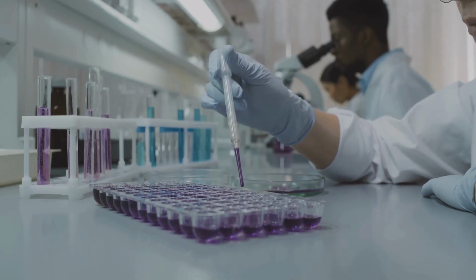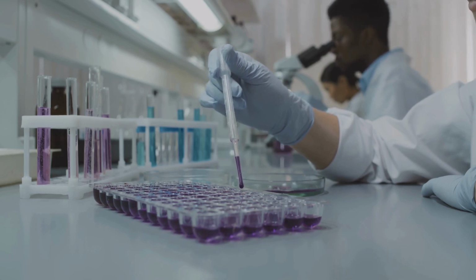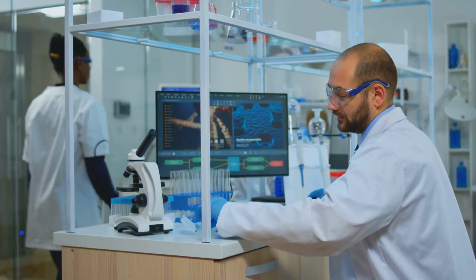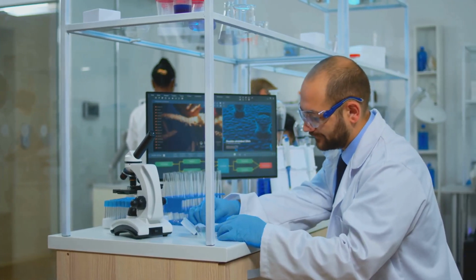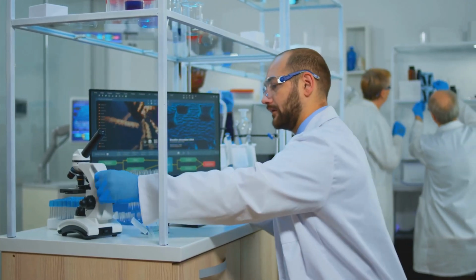Laboratory techniques for genotyping and sequencing in pharmacogenomics. Genotyping and sequencing are fundamental laboratory techniques used in pharmacogenomics to identify genetic variations that influence drug response.